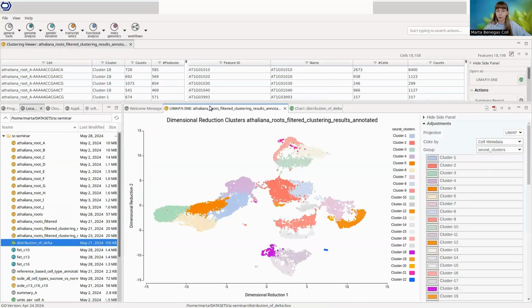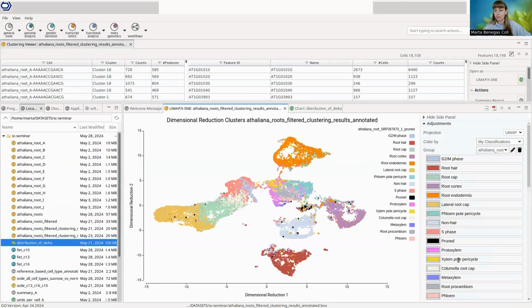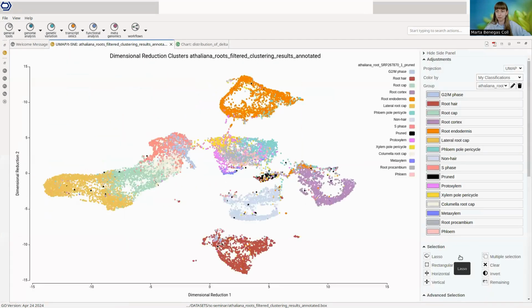But I would go into this now for the sake of brevity. So here we can find the predicted cell types by SingleR. And SingleR, if the cell labels are a little bit ambiguous or unreliable, names them "pruned".